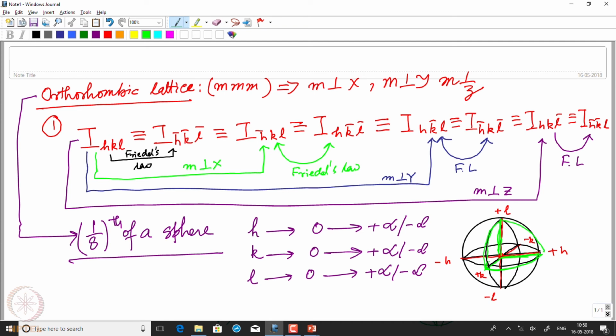Then we talked about the number of reflections that one can achieve using the Ewald sphere and limiting sphere concept, and then we tried to understand what are the unique data that is required for low symmetry cases which are most common in crystallography. Triclinic, monoclinic and orthorhombic, these three different things need only a very limited data.